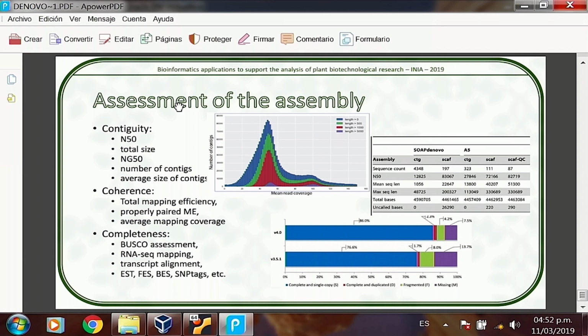Yep. If we start summing up every contig from the biggest to the smallest, in our case we only have 2, yeah. In what contig did we surpass the 65,000 mark? In the first one. So the size of the first contig, that's my N50. That size, the size of the contig where I reached or passed half of the assembly, that's my N50.